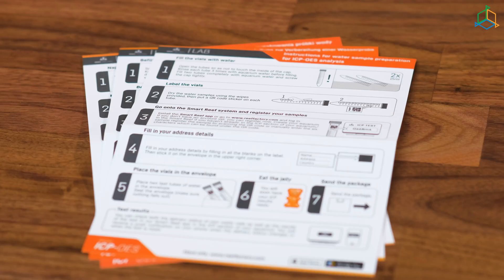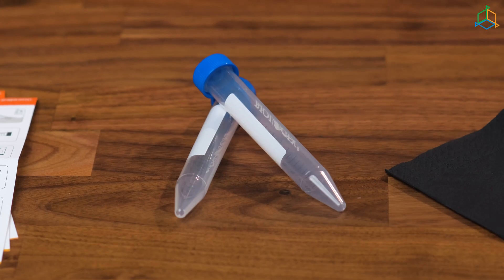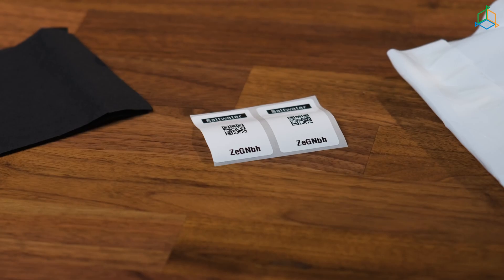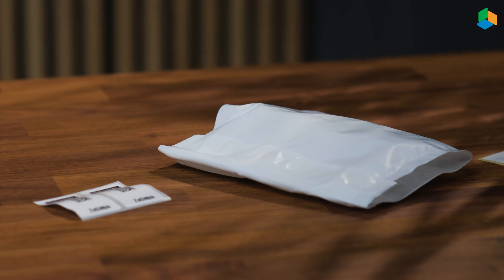Let's start by unboxing! The SMART ICP box includes the instruction manual, two test tubes, a tissue for drying the test tubes, two stickers with a QR code, an envelope, shipping labels, and yes — gummy bears! That's essential!